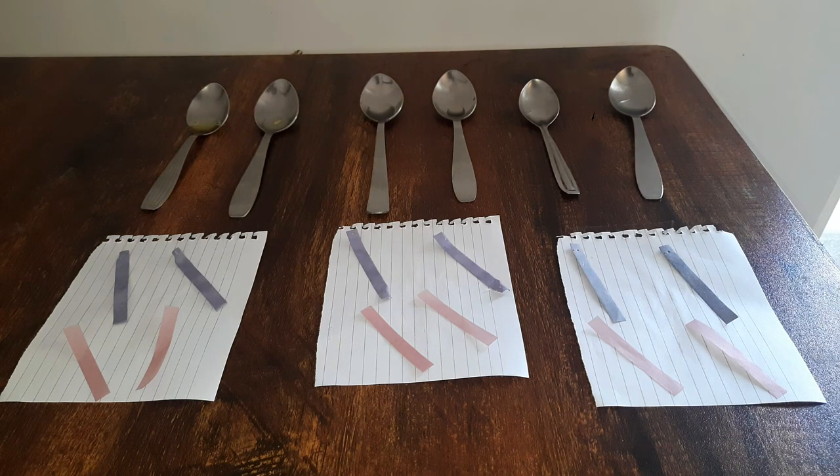What we will do is we will let each litmus paper come in contact with the substances over here, and we will observe the color change, if there is any, to the litmus paper. Alright, so let's begin.